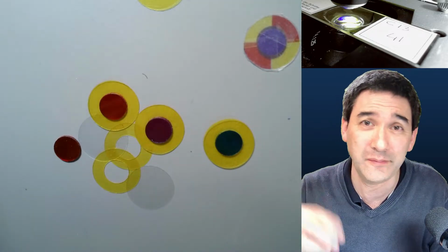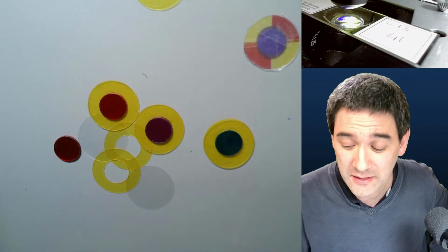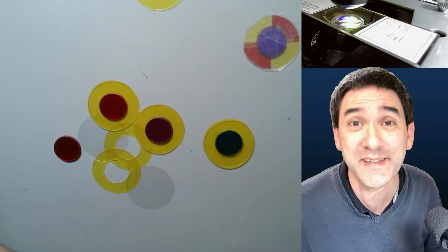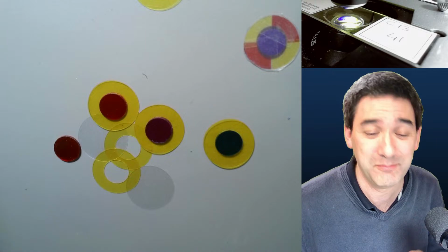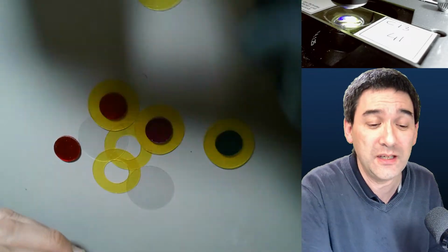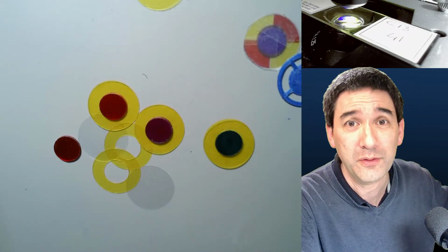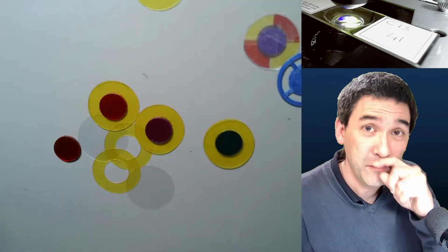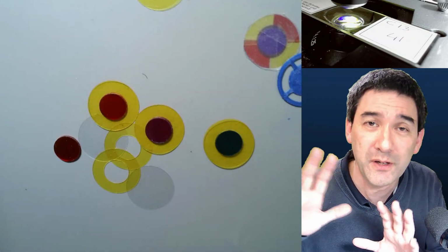Like the optics and the camera sensor size and so many other factors. So when people ask me what's the best combination, I'm almost a little bit afraid of giving advice, because it might be so different from microscope to microscope. So I always say you've got to try it out. For example, I tried to connect my DSLR camera to my stereo microscope using the same adapter. The image quality is horrible, because somehow the microscope optics and the adapter optics don't cooperate well. So it's a fuzzy, blurry image.